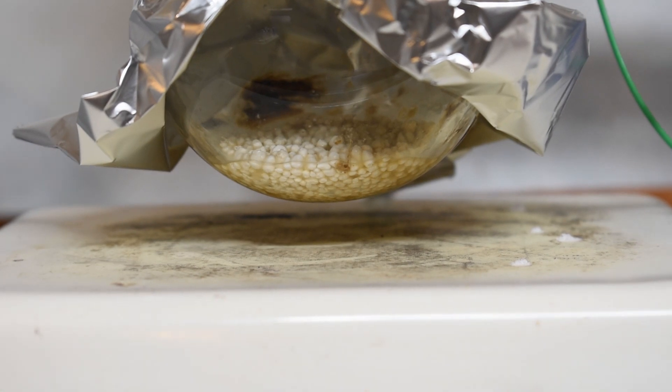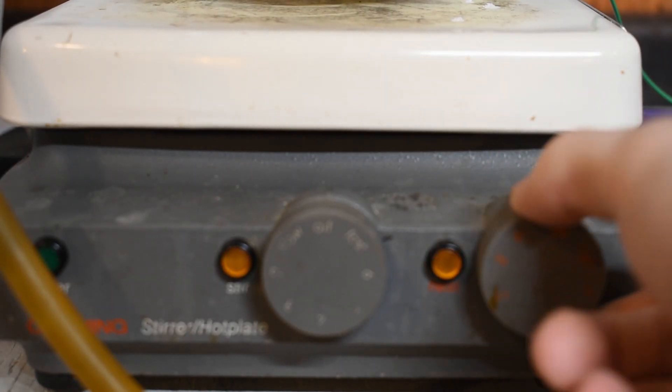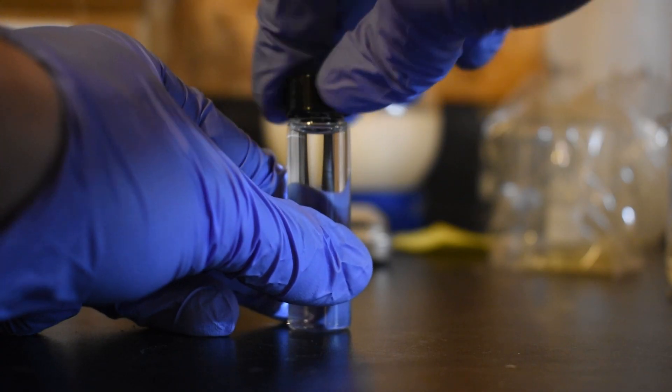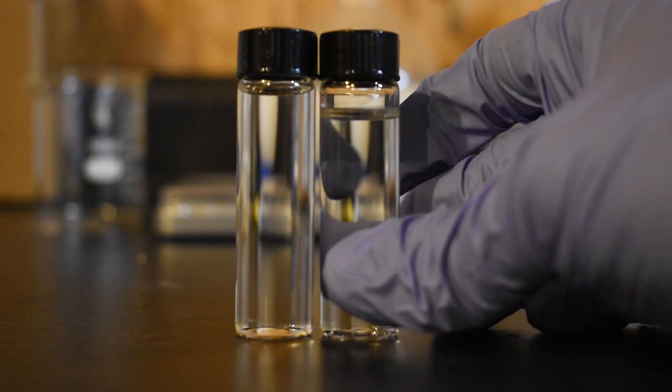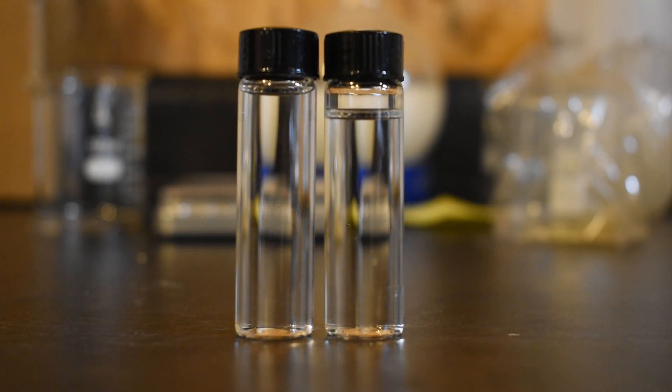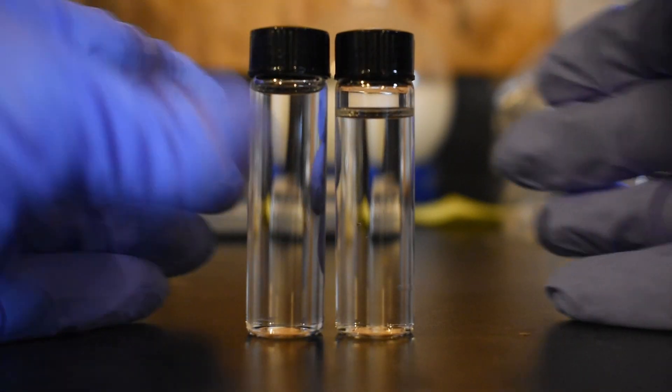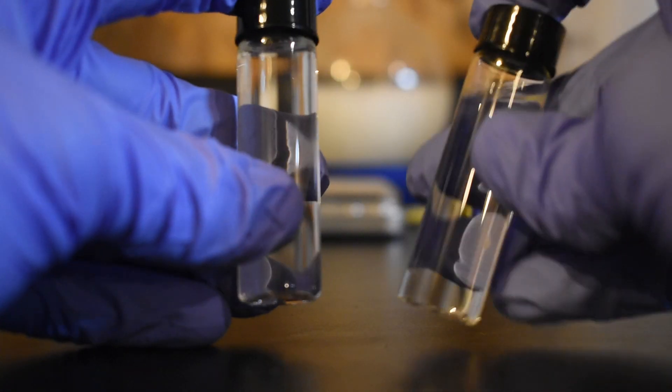As the distillation flask was almost empty, I turned off the heating, and we were left with some pretty nice crystal clear liquid. In the end, I was left with 14.4 grams of isoamyl acetate, which corresponds to about a 41% yield.